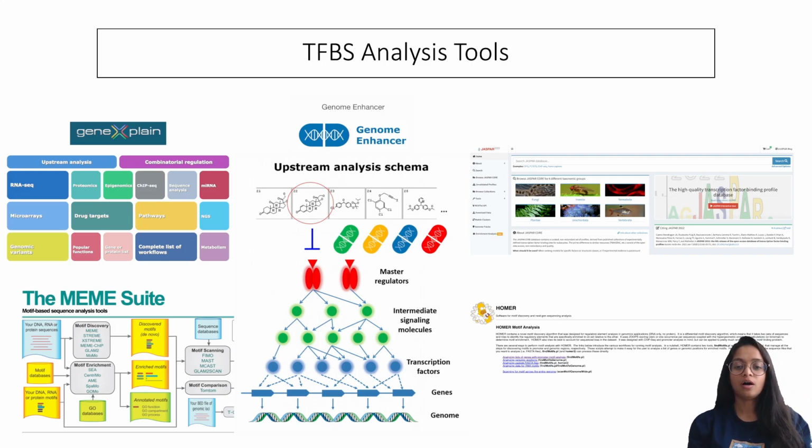So here we have Homer, which is essentially a widely used motif discovery and transcription factor binding site analysis tool. It can identify enriched transcription factor binding sites from DNA sequences and ChIP-sequencing data. And today I will be using this tool to demonstrate some transcription factor binding site analysis.